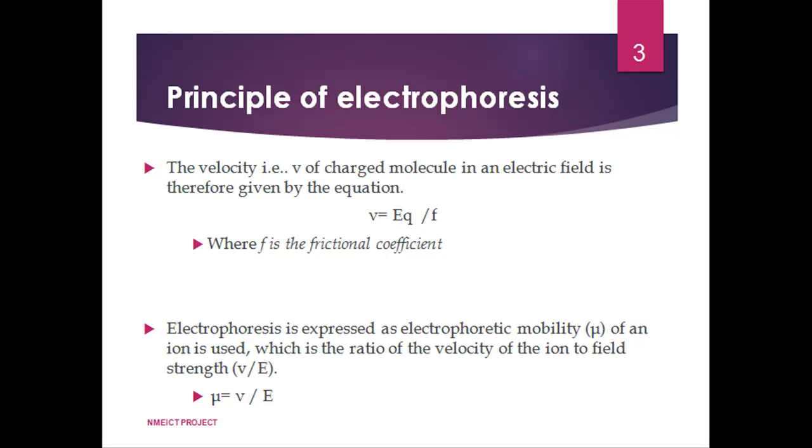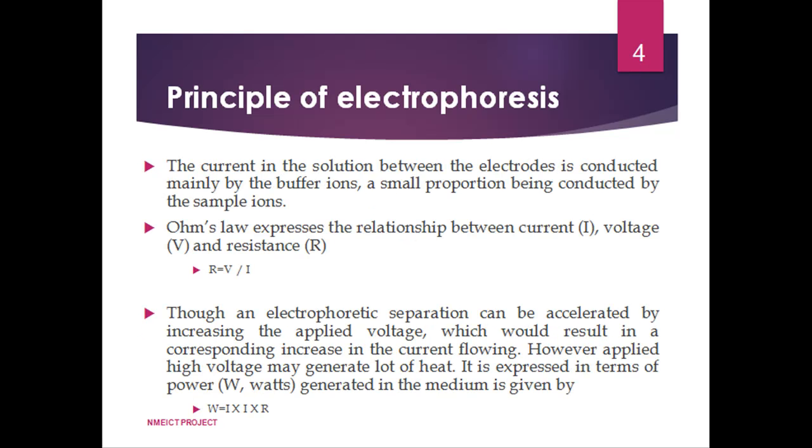When a potential difference is applied, molecules with different overall charge will begin to separate owing to their different electrophoretic mobility. Even molecules with similar charge will begin to separate if they have different molecular size, since they will experience different frictional force. In addition to the charge of a molecule, the difference in molecular size, and hence frictional resistance, plays an important role in the separation.